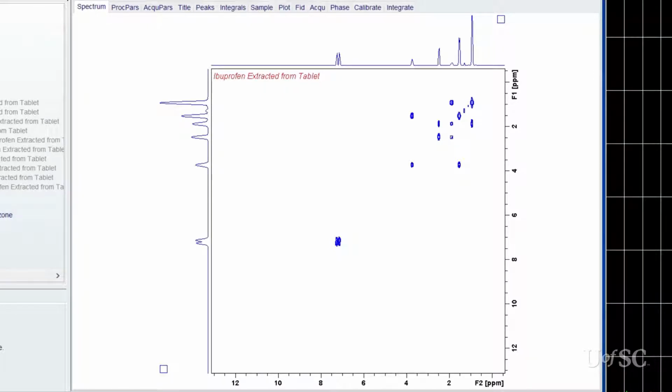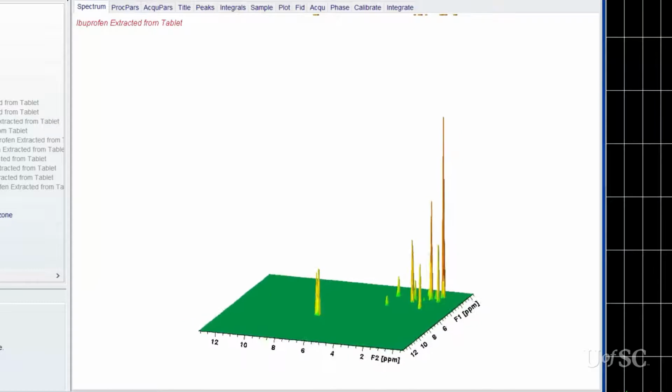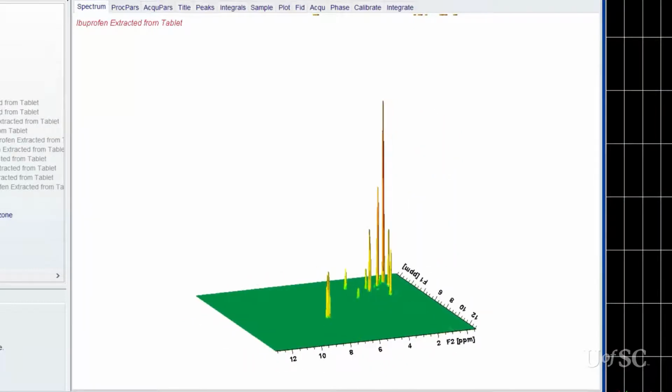Typically, these datasets are shown as contour maps. Like a topographical map, the rings in the peaks denote an amplitude. Taller or more intense peaks will have more rings. The peaks in the spectrum can be shown with a pseudo-stacked display. Notice how the peaks have shapes similar to a 1D spectrum. Let's go back into the contour display and look at some of the controls in Topspin.